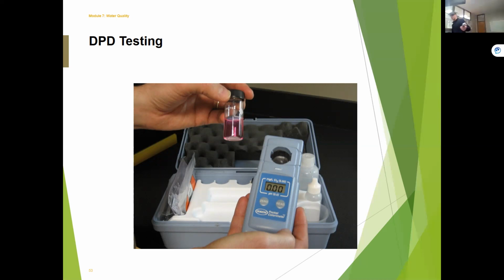We're gonna fill our sample vial usually, right? You're gonna fill it and see that diamond on the front. It's really important to think about, as we talked about with the turbidity meter. Light's gonna shine right through here, and it's gonna shine through the sample and there'll be a detector at the head of these things.